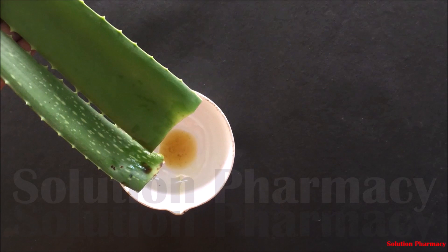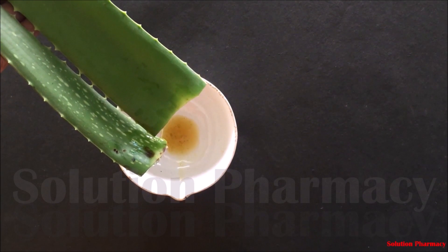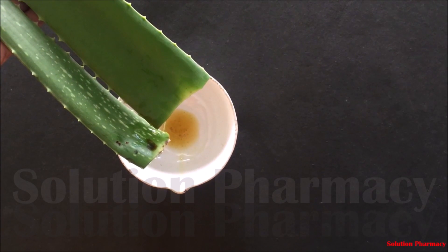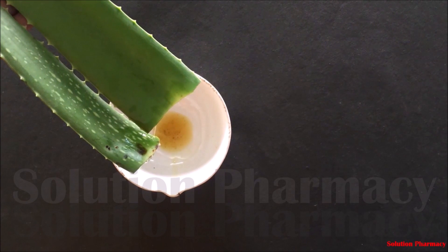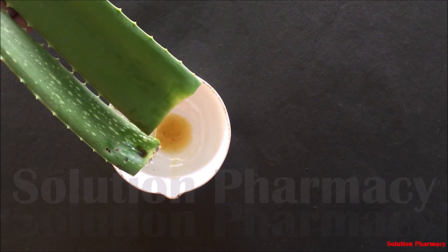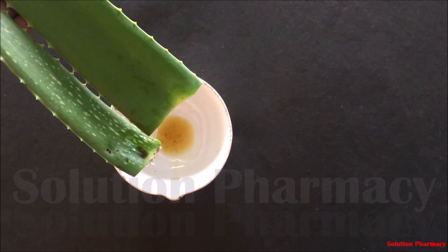Take a fresh aloe leaf from a plant and stand this aloe leaf in an upright position in a china dish or any other container bowl for one hour maximum. You can see that the yellow liquid — yellow resin — comes out of the leaf into the china dish. This yellow liquid can irritate our skin, so it is important to remove it by completing this step.